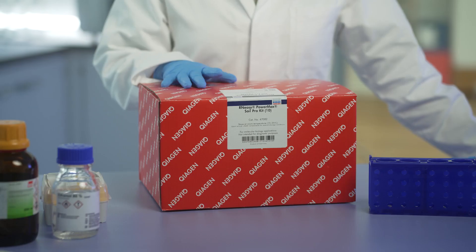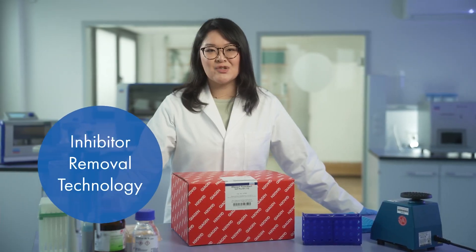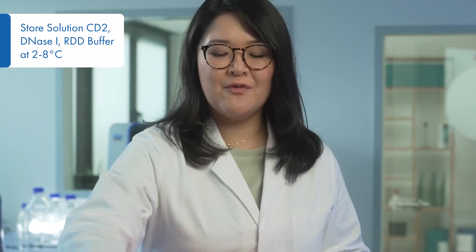This is the RNeasy PowerMax Soil Pro Kit. The kit uses advanced inhibitor removal technology to help you extract high yield and high purity RNA. Make sure to store solution CD2, DNase I, and RDD Buffer in the fridge.